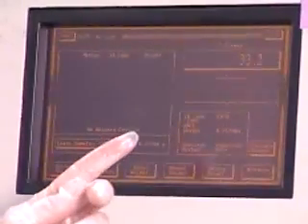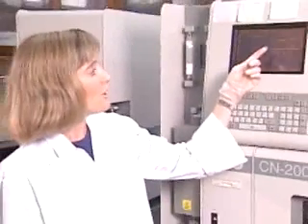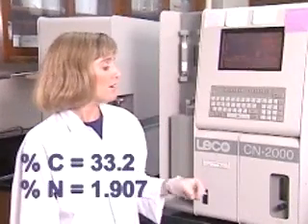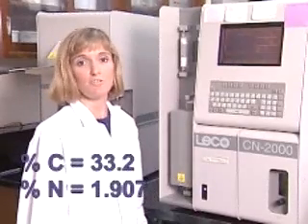The total carbon and total nitrogen numbers are displayed on the screen. They are also printed out onto the printer. As you can see, the percent carbon is 33.2 and the percent nitrogen is 1.907. You can then download your data onto disk and take it to your computer for further processing.